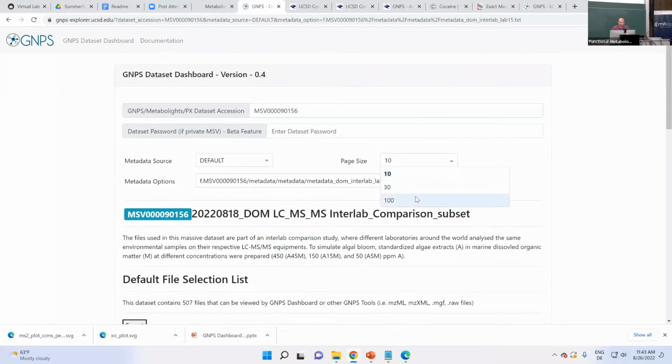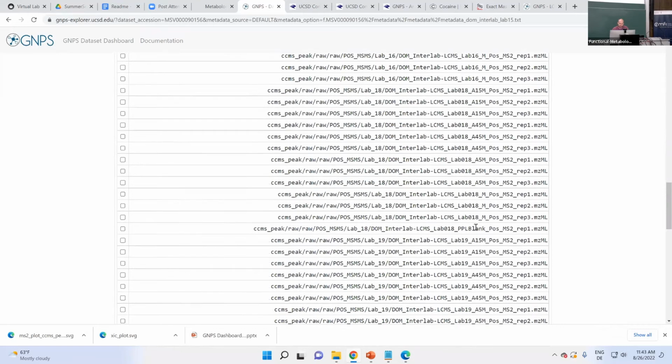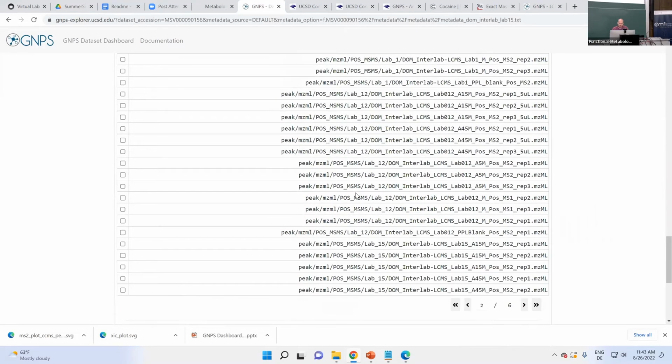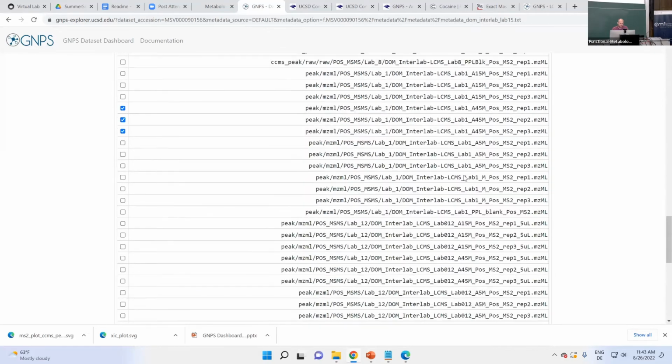All right, so let's start this again. Go to the Dataset Explorer. I'm gonna now filter both lists. So lab 1, I select here the peak. A45 is kind of my endpoint. And then in the second group, oh wait, that was the second group.